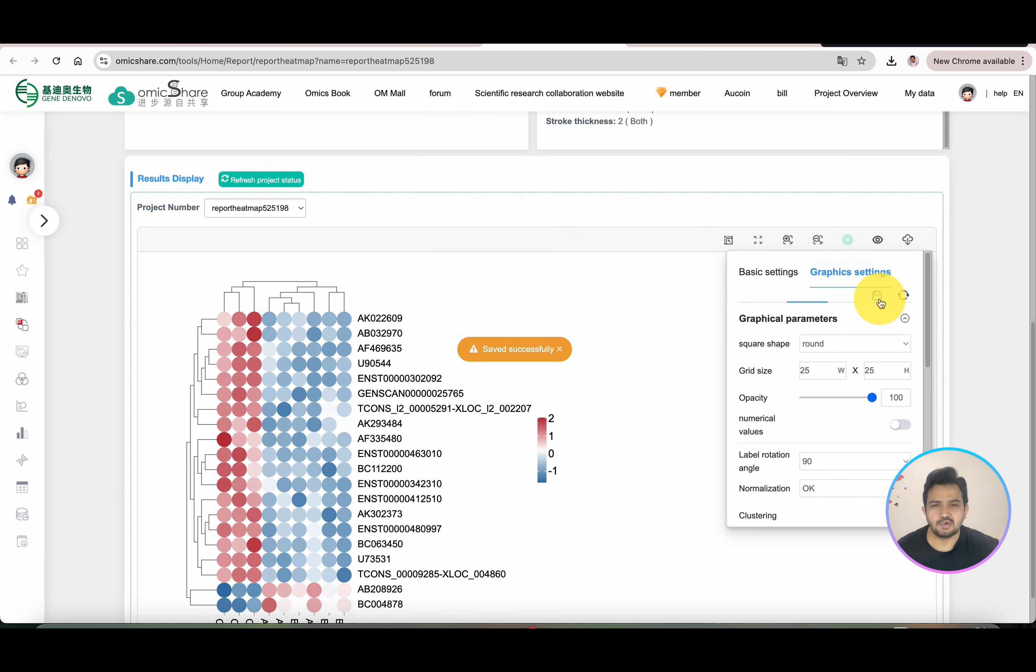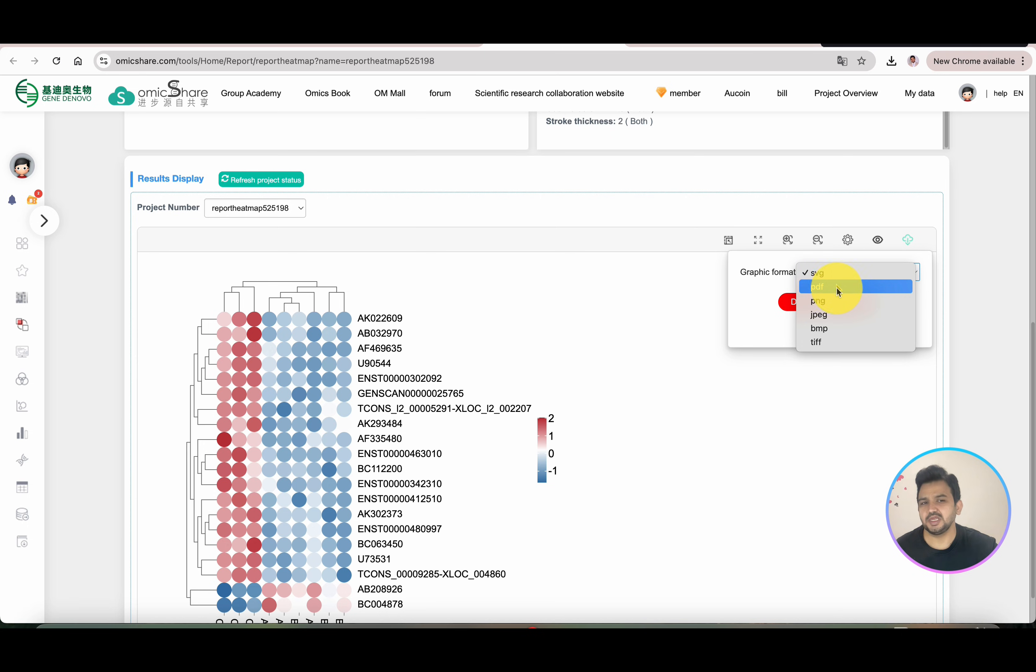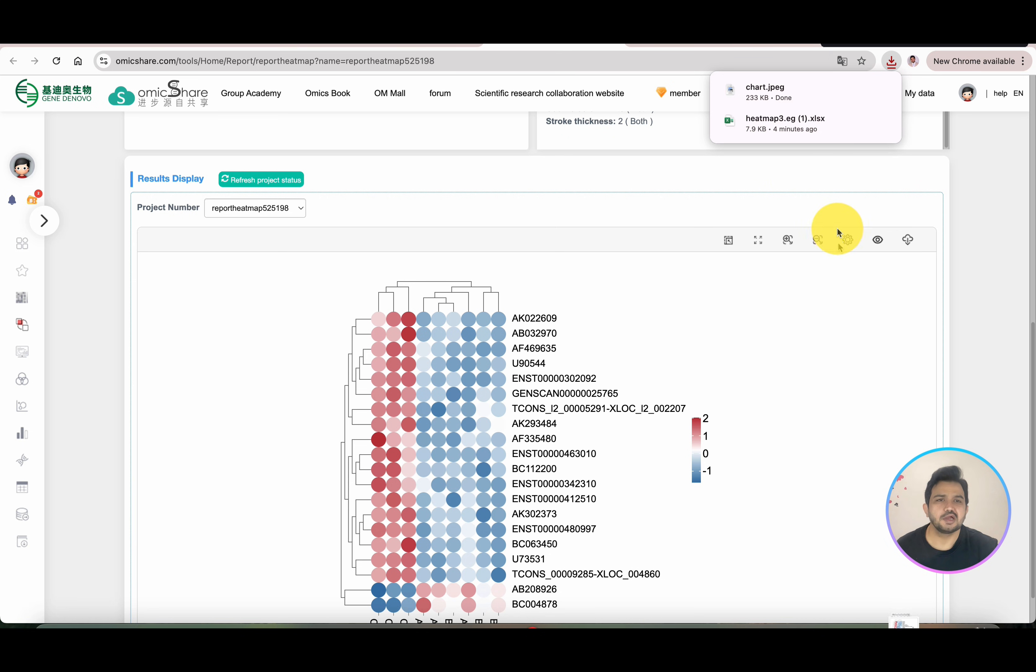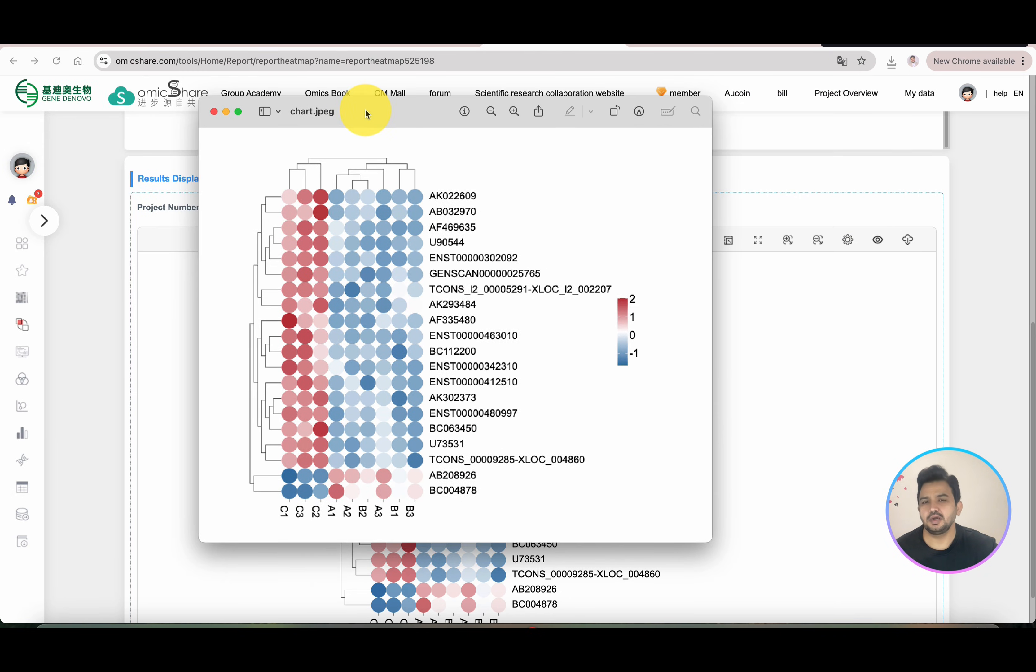Once you have completed everything, you can simply go with the Save option. Once you click on Save, it will ask you to download. The graphic can be downloaded in the form of PDF, PNG, or JPG. For this example, we can download it as JPG. We will simply click on Download Graphics. Boom! You see, our heat map is ready.